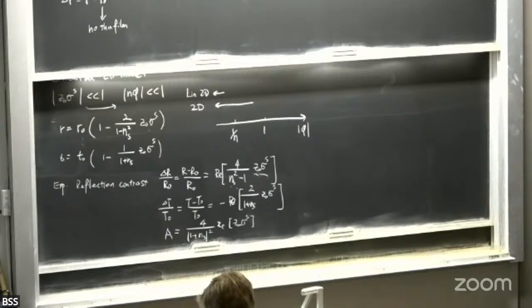So in that case, why would delta R over R, which is the experimental value, not? Oh, that's what you don't measure. Yeah, we measure it, but the goal is to get sheet conductivity, for example. No, this model, this simulation just tells you whether the model is applicable or not applicable. This assumes you know the conductivity, but in experiments, when you just measure something, you don't know which model is applicable, right? So this gives an idea.